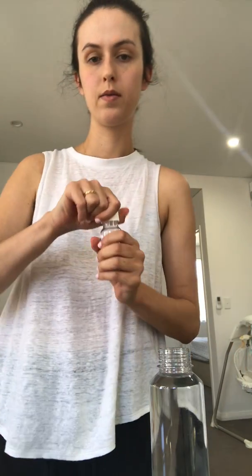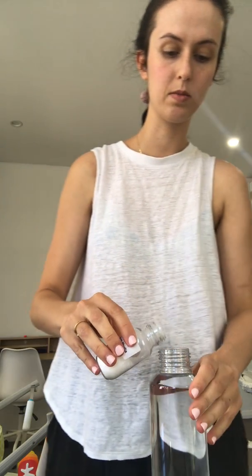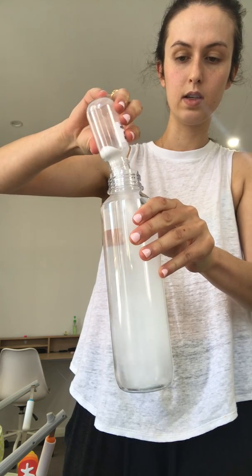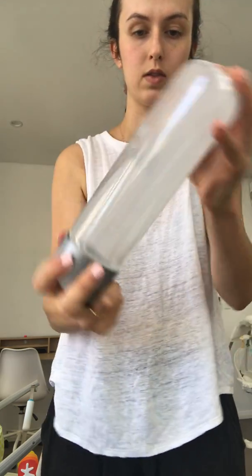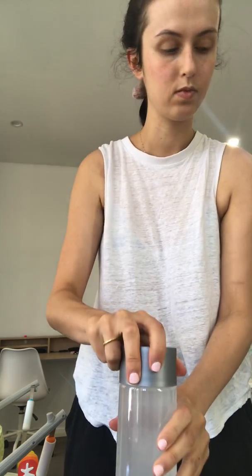Now that we have everything that we need, the first step is to get the 500 mils of bottled water. Then we're simply going to add the culture salts into the water until it's completely dissolved — just shake that around. So that's all done.